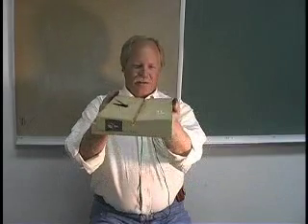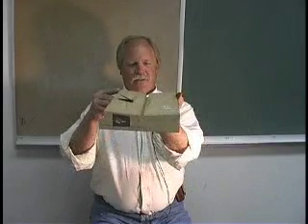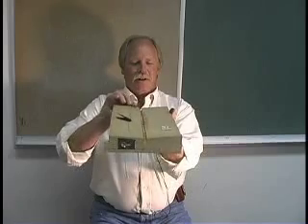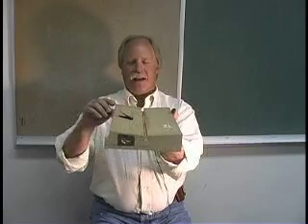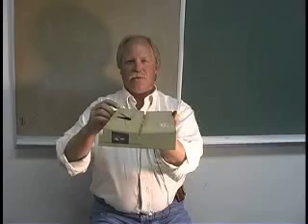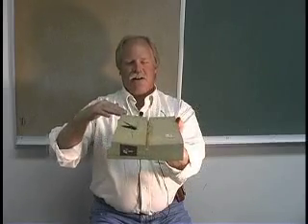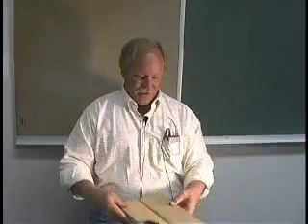As you can see on edge, each side of the spreading board is angled so that in the center where the body goes, it's going to be more narrow than at the edge where the board itself is wider. So that allows the wings to be positioned when they're dry a little bit higher up on the board.